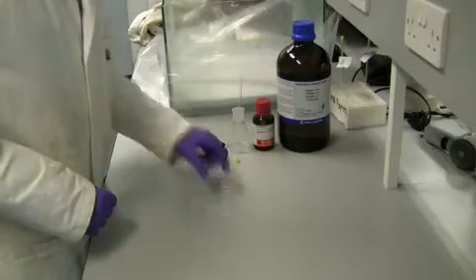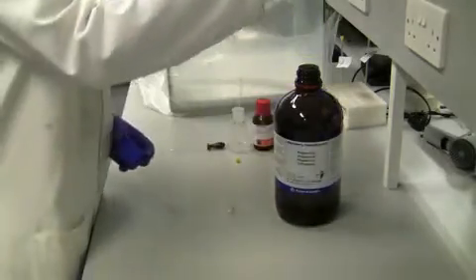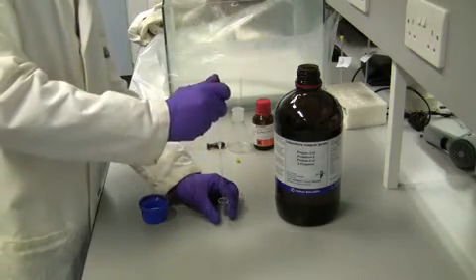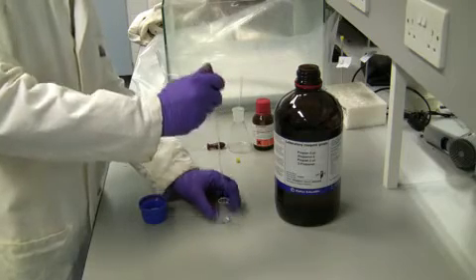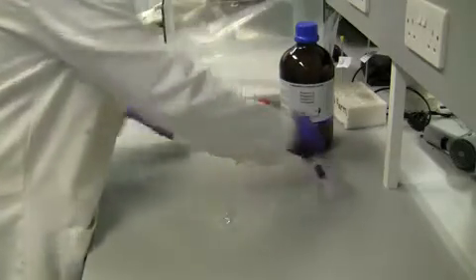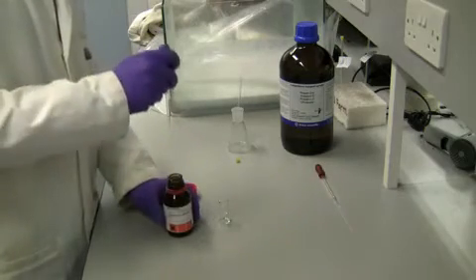In the lab, a few drops of the sample — in this case a liquid — is placed in a sample vial. A deuterated solvent, in this case deuterated chloroform with the formula CDCl3, is then added.